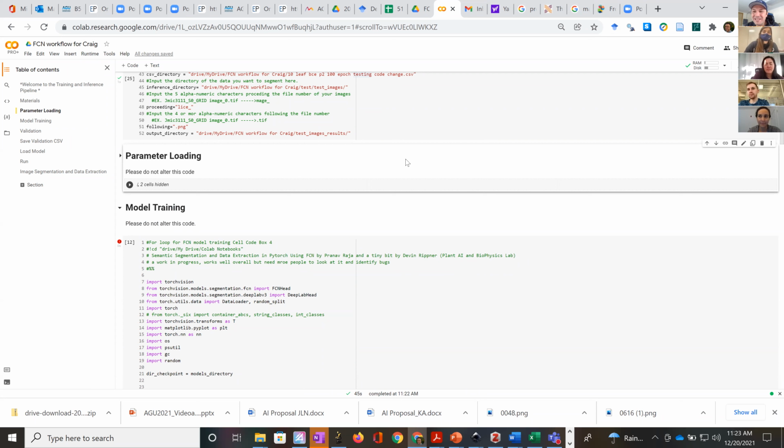But it's never seen a Vitis vinifera leaf. And so, if you were to add Vitis vinifera leaves to the training data set, I'm sure it would do fine. So it just depends on how big your training set is and how diverse your training set is. You really want to capture the diversity of whatever you're analyzing. And so, if you're only working with Vitis or juglans or whatever it is that you're working with, maybe train on those leaves.